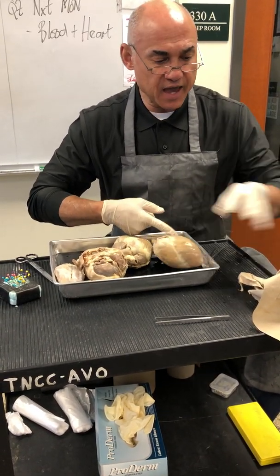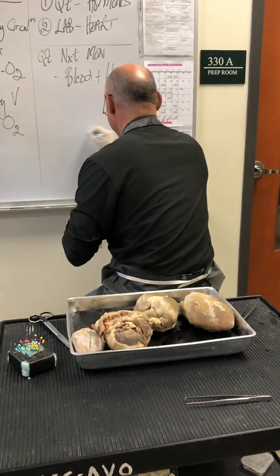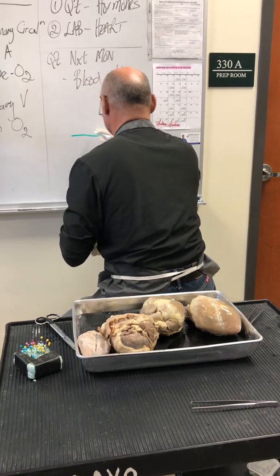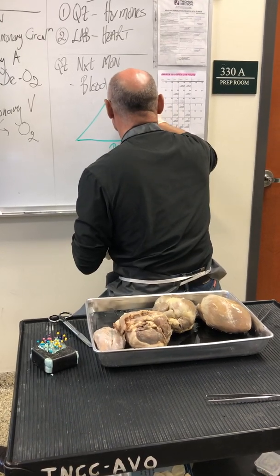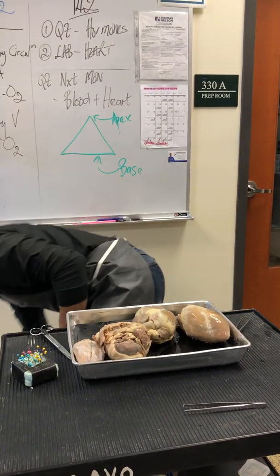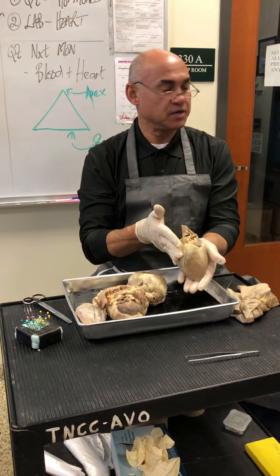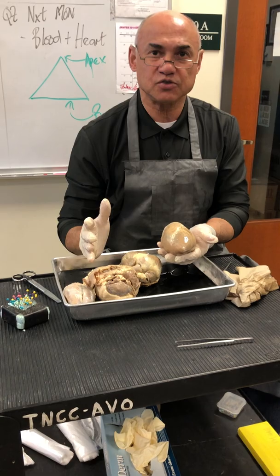All right, now if you think about a triangle, what do we see with triangles? This base, apex. So notice what happens here. We could be using the same analogy, same language. Then the heart is an upside down triangle arrangement, right? Because there's the triangle analogy, but it's flipped around. So base, apex, that's just for your information. I'm never going to test you on that. There's just way too much other information to test on, okay?